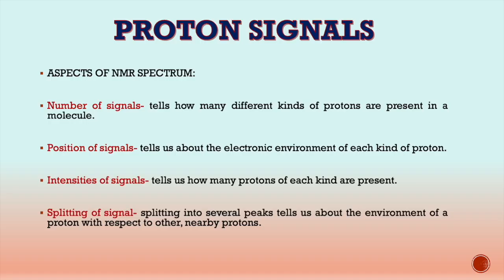So from this conversation, we can come to the conclusion that all the protons absorb at different applied field strengths. And it is this applied field strength that is measured. And the result is a spectrum which shows many absorption peaks. These many absorption peaks reflect the differences in the environment of non-equivalent protons. And this can give almost unbelievably detailed information about the structure of a molecule. Let's see how we get it.